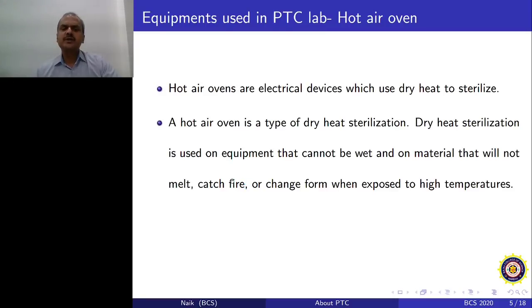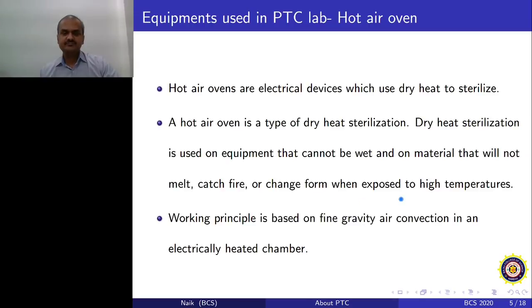So don't keep paper, don't keep plastic, but you can keep all types of glasswares which can easily tolerate that hot air. And whenever you wash those glasswares and keep them in this hot air, they are going to get clean and they will be dust free.